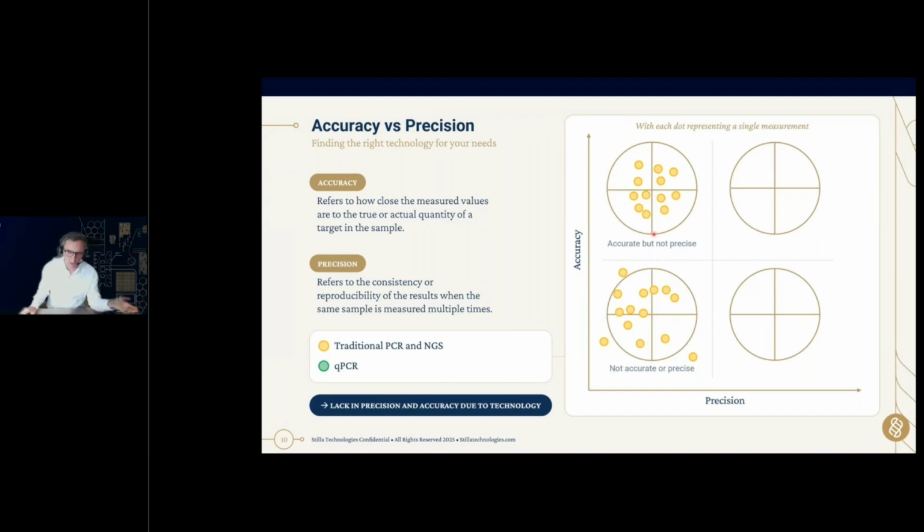You know that, for example, if you run an agarose gel and repeat it 20 times, sometimes it is a bit more blurry. Sometimes you have a pale band, sometimes a blurry band, sometimes an elevated band. You don't know why, but somehow you get a signal and you know, okay, there's something in it. I don't know how much, but it fluctuates a bit around the perfect result. Then we also have the possibility that we are neither accurate nor precise. You measure a DNA 3 times, and one time it is negative, one time it is positive, the second time you have 2 bands, and the fourth time it looks okayish but ugly. That is what we mean by not accurate and precise. For NGS it's not that bad, but we have the same issue: when you have very low GM concentrations, you might be below the threshold of 5% of all reads, and then you are not able to measure, for example, a low concentrated GM.